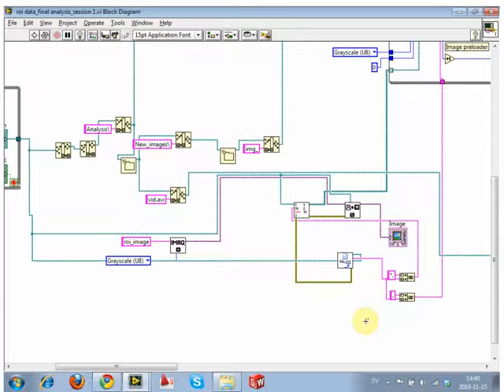Not all the time do you have that. Apart from the confocal, there are very few other instances where you actually have to filter based on file name. Normally, you just have to filter based on extension. But this cannot work if I choose the channel 0 corner, because it's not the extension? No, it's okay. You put a pattern to filter. You could do an explicit one, or you could just make an add-on to this.